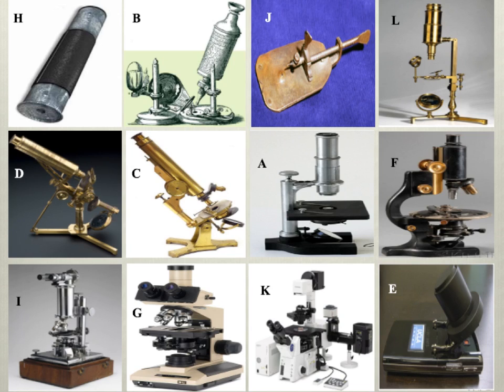All right, hello biologists. We are here talking about learning targets 1, 2, and 3 for cell structure. So we're going to talk a little bit first about microscopes. This first slide shows you a picture of the history of the development of the microscope over the years.